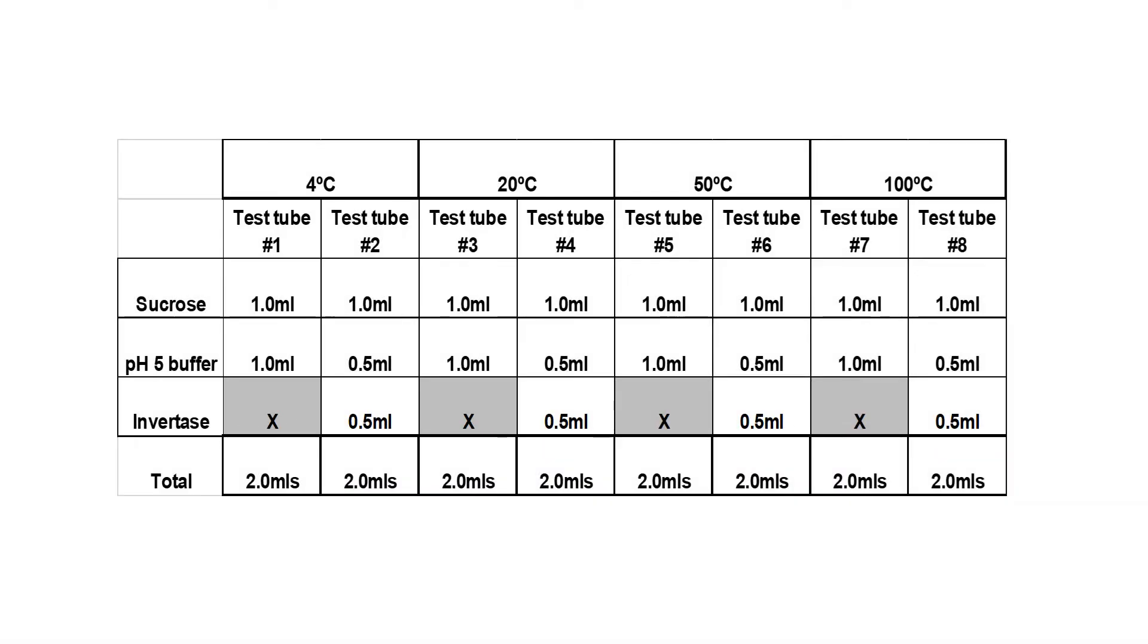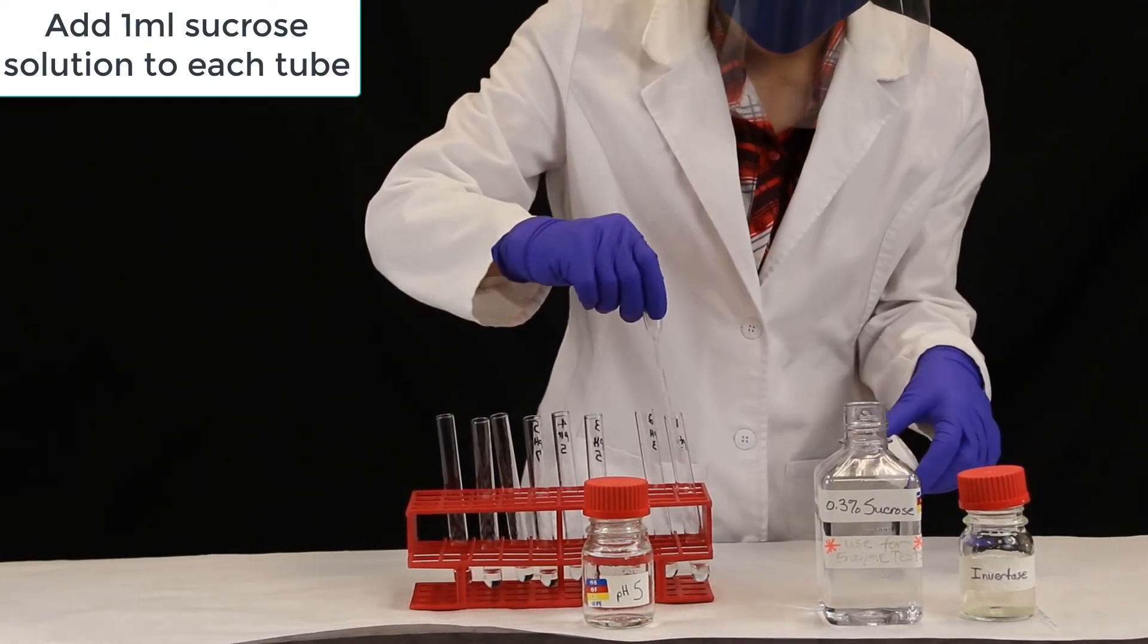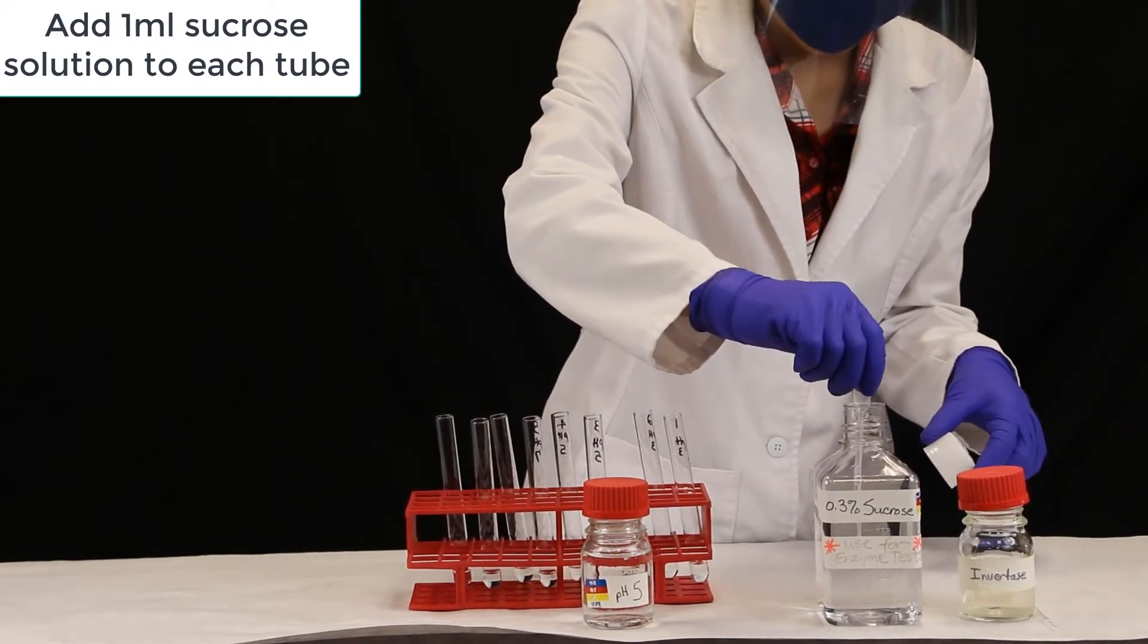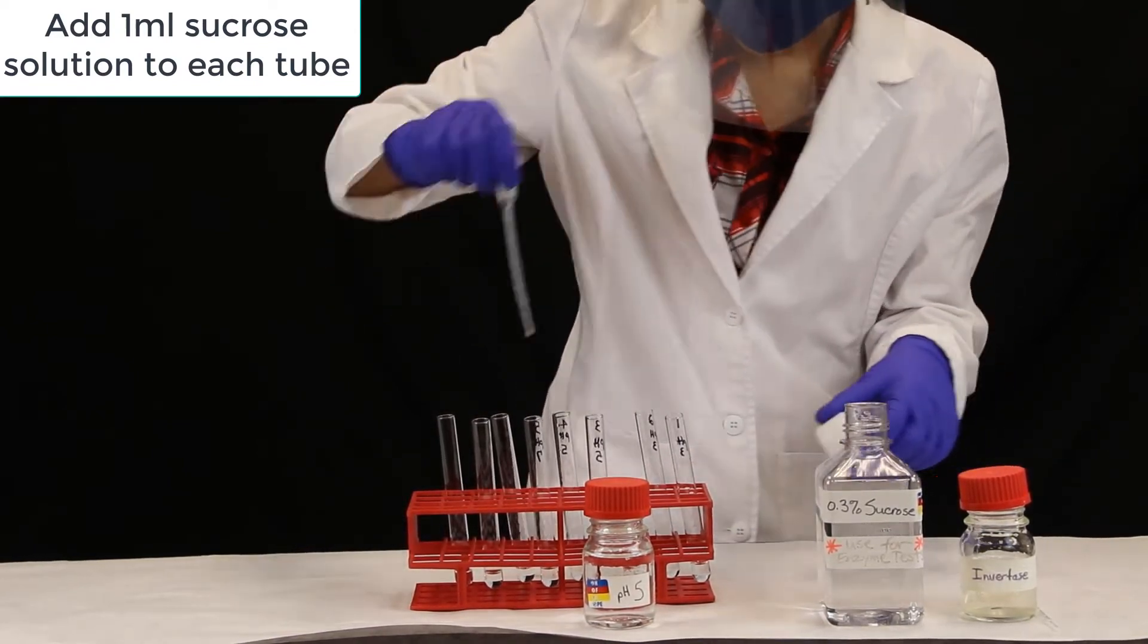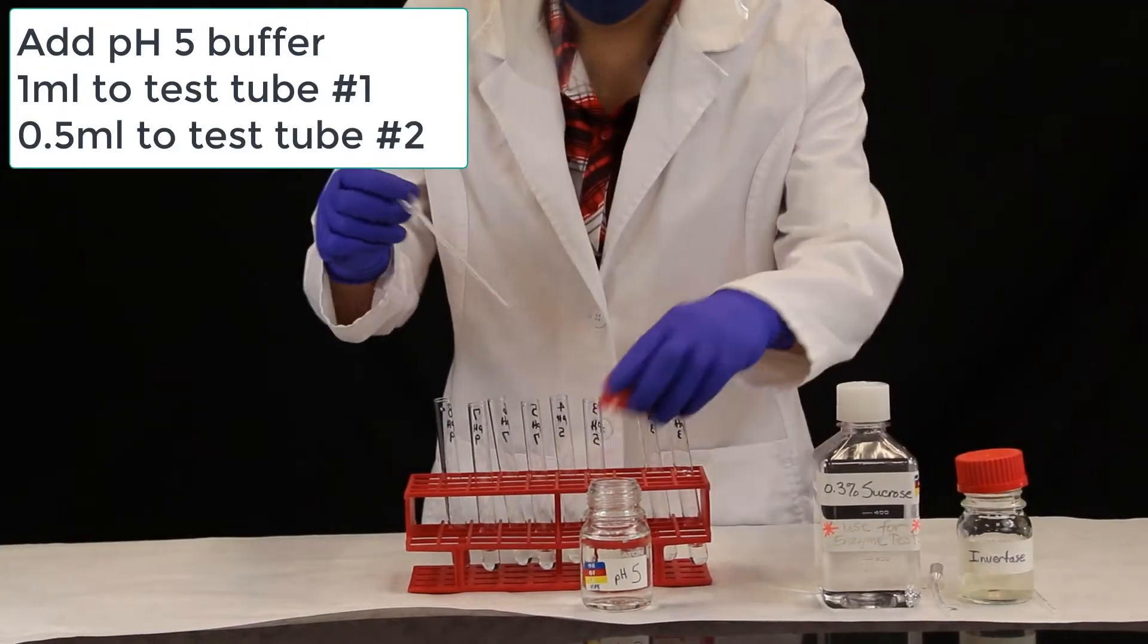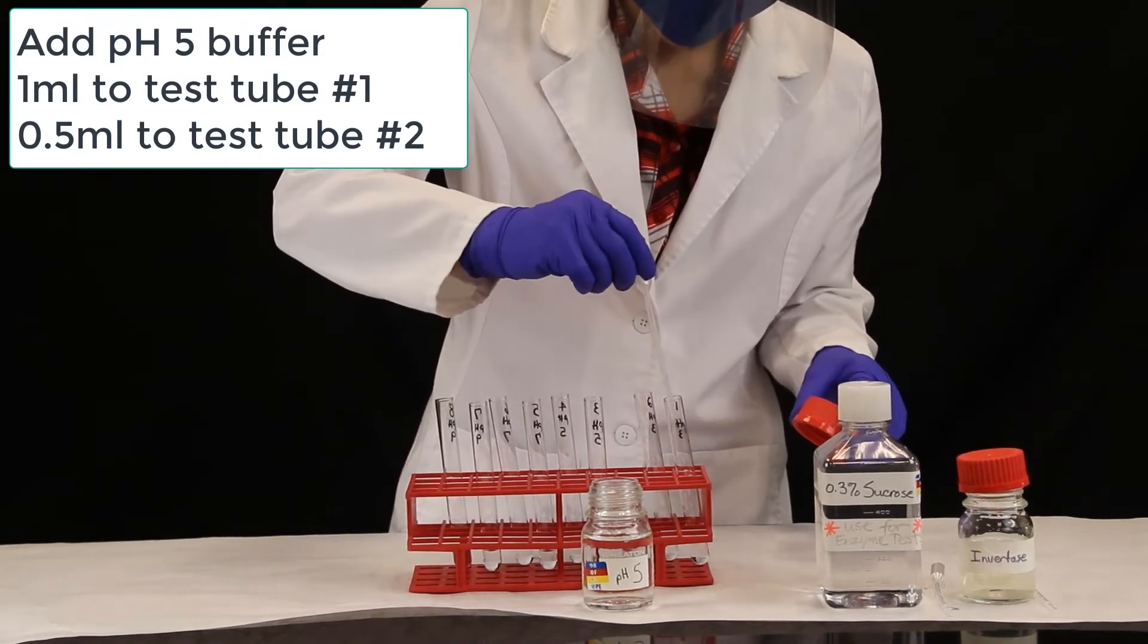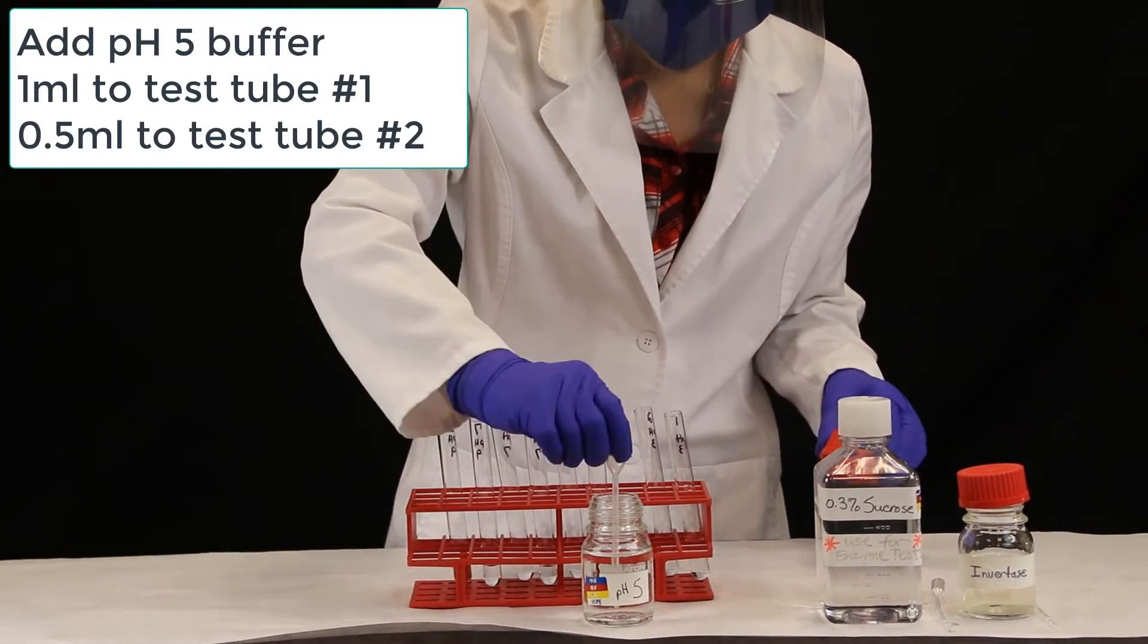We will be adding solutions in this order. First we will add 1 ml of sucrose solution to each test tube. Then we add our pH 5 buffer, 1 ml into test tube number 1, and 0.5 ml to test tube number 2.